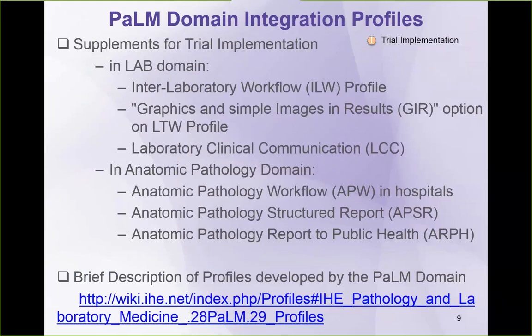And then we have some supplements for trial implementation. So there's the interlaboratory workflow. That's when one lab has to send testing to another lab. We have graphics and simple images and results option for the lab technical workflow. That's basically when instruments can send graphs or images back to the result manager. And then we have laboratory clinical communication, and I'm going to talk about that a little later.